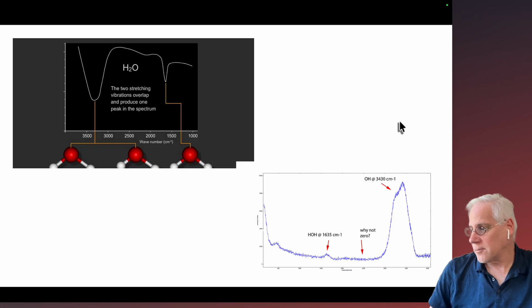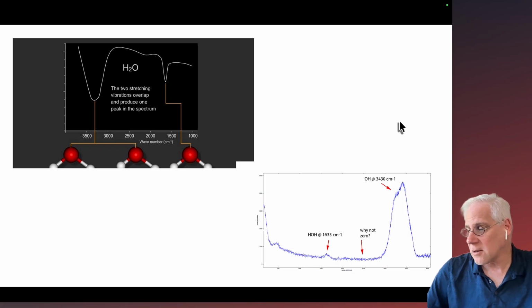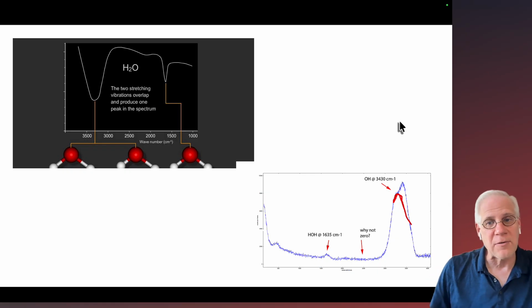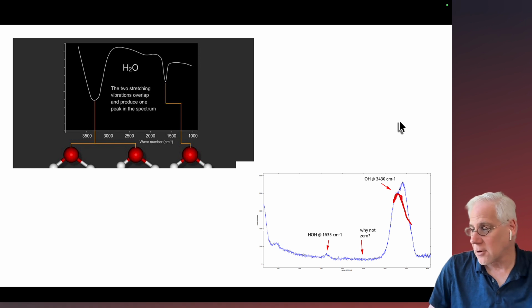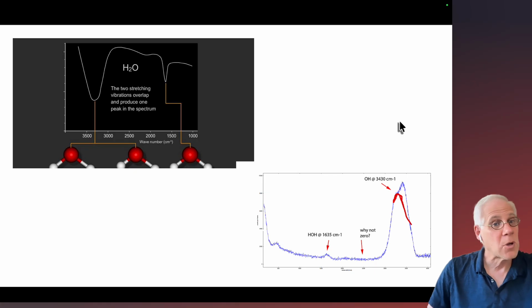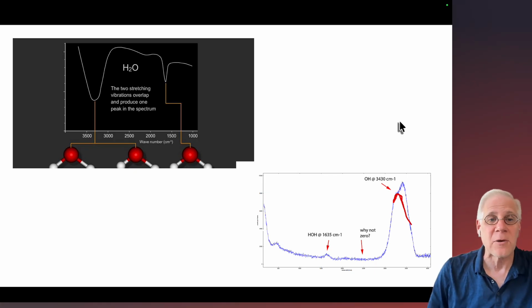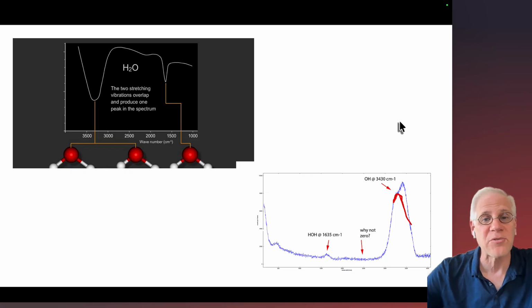If we look at our Raman, we see some of the same thing, except you can see that they're a little bit farther apart, a little better resolved here. So we have a peak right here. This other peak is probably right around here coming down, but it just adds on to it, forcing that other one up. So there are actually 2 peaks there, again, very close together. And our third peak here is extremely weak down here. So we expected 3 peaks for both IR and Raman. We got 3 peaks, and we did that just through using the character tables and symmetry.